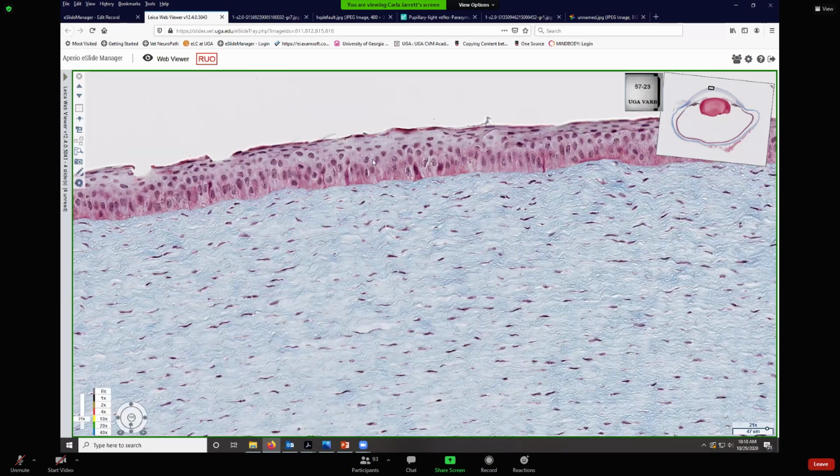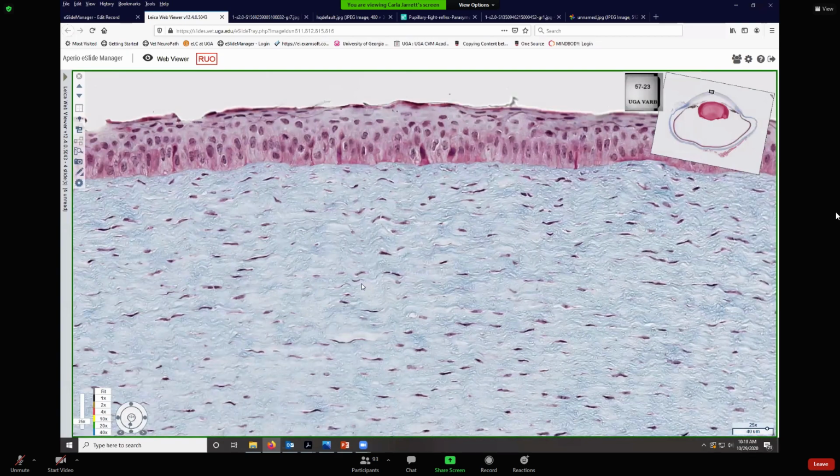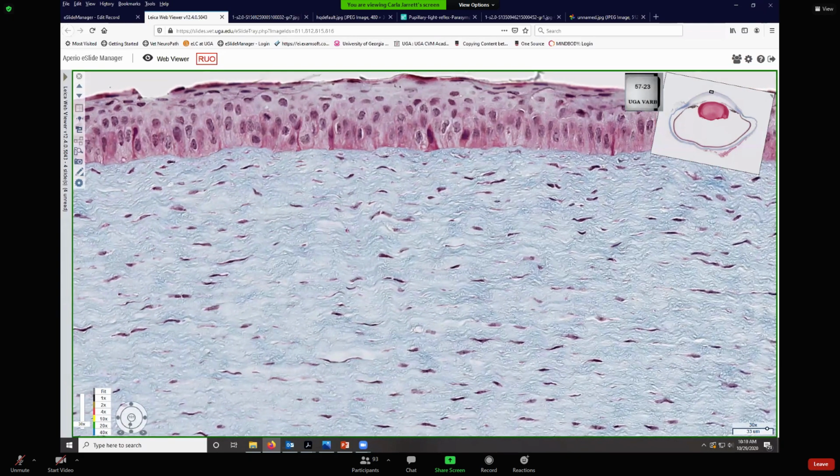This anterior epithelium, would you expect it to be cornified or non-cornified? I hope you're thinking non-cornified, because that would be correct. If it became cornified, it would be hard for light to pass through it. It does become cornified during pathology, but it should not be in a healthy animal. So this is called the anterior epithelium, stratified squamous, non-cornified. Now it has a basement membrane, and that is called the subepithelial basement membrane. So there's no surprise in that.